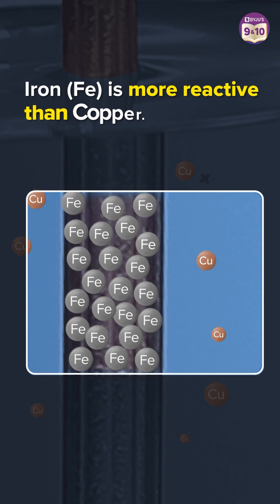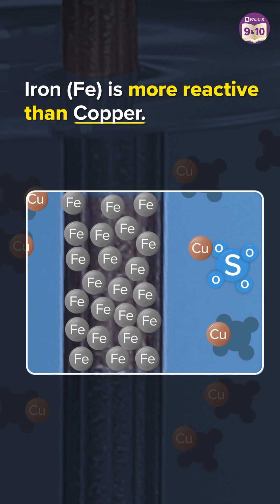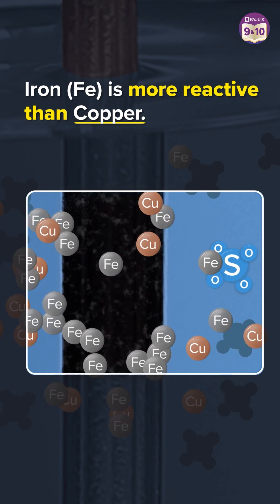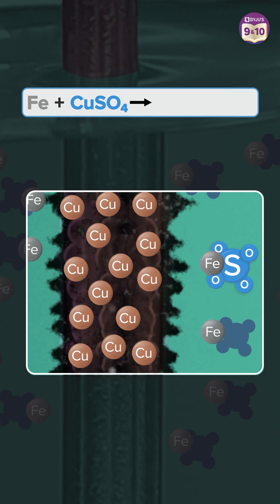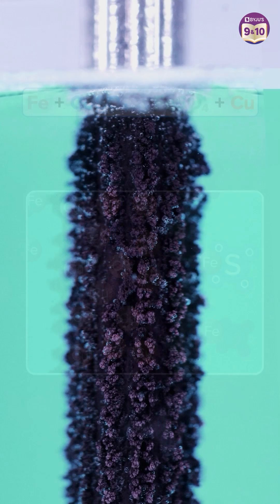However, iron is more reactive than copper. Hence, iron displaces copper in the solution. It is this deposit of copper that leaves the nail brownish.